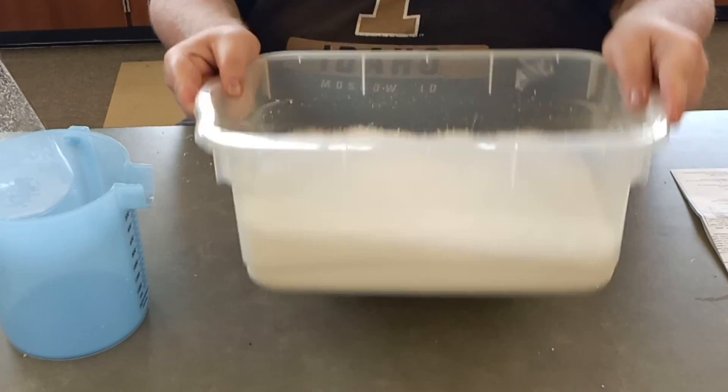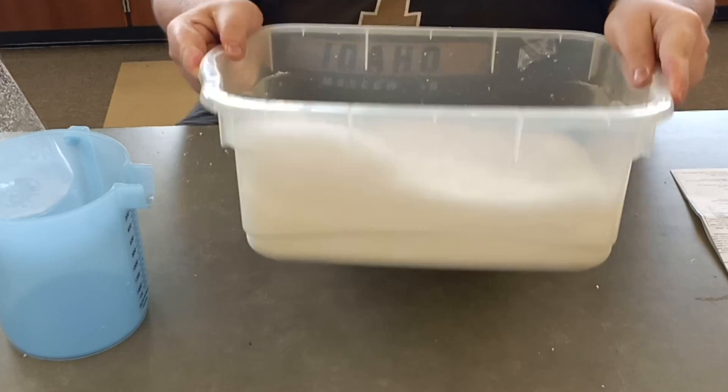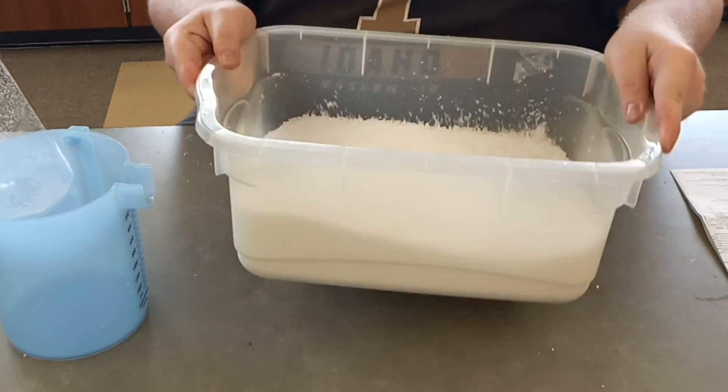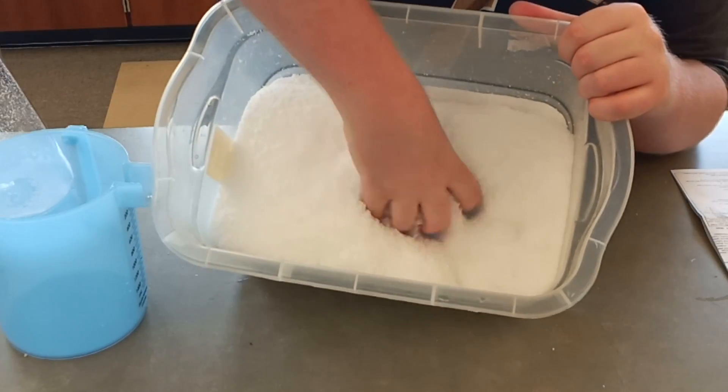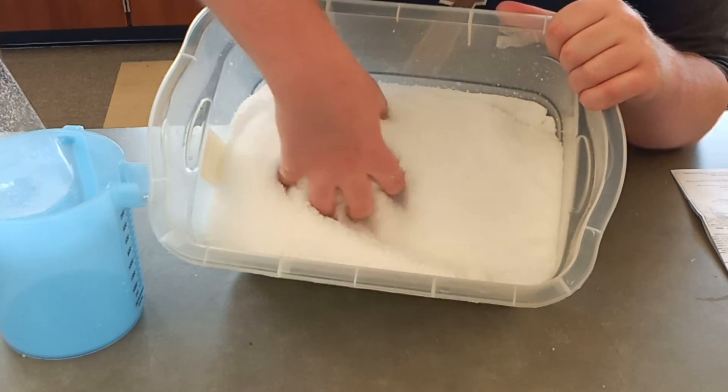It is interesting to note that when you touch this it does feel cool to the touch — not necessarily cold, but definitely cool — which would indicate there's some sort of endothermic style reaction probably going on.